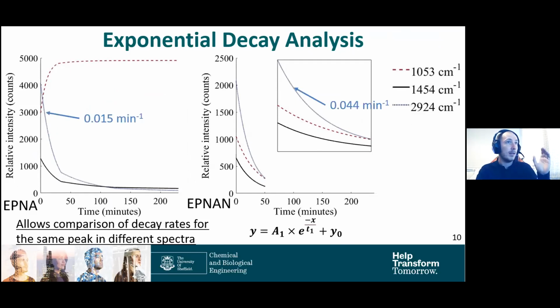Here we can see this is the CH stretching peak, which decreases over twice as fast in the full precursor solution compared to the one without the nickel nitrate. And then it's similarly over twice as fast for the CH bending. So they're both representative of that evaporation. And you can see that measurably the evaporation is faster regardless of these gelation reactions that we've seen occurring in the full precursor solution.